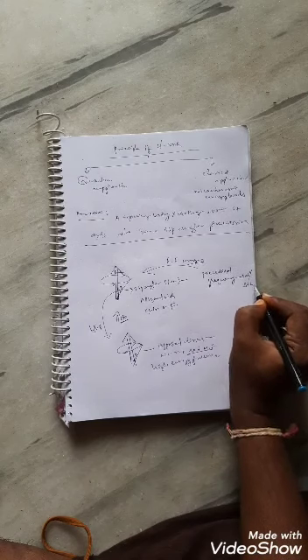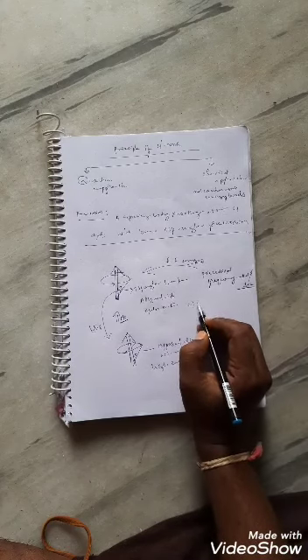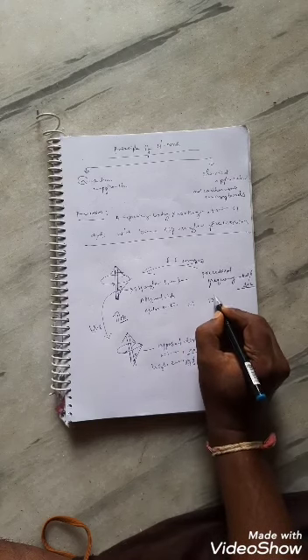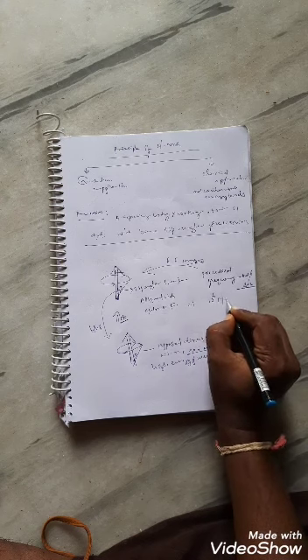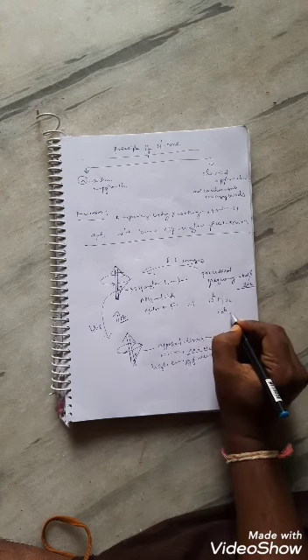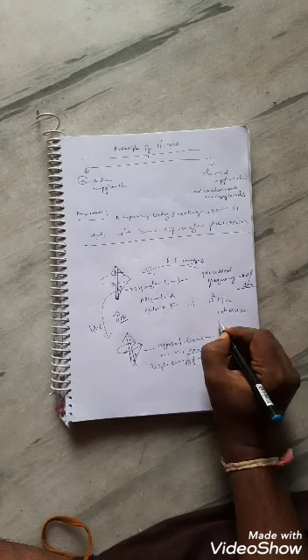Since a nuclear magnet has a high precessional frequency, in the range of 10 to the power of 6 precessions per second, we generally write it as the 10 to the power of 6 hertz, megahertz range, right?